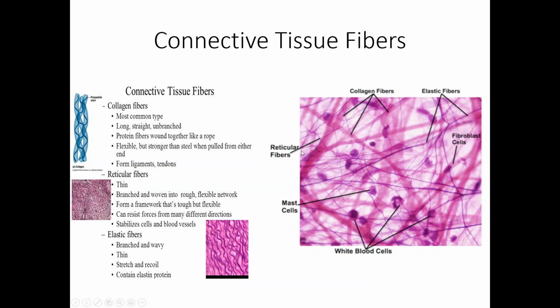And so here we go. We labeled this over here. All these skinny little ones over here. See how it kind of makes almost a spider web, and we're holding these other cells in place.